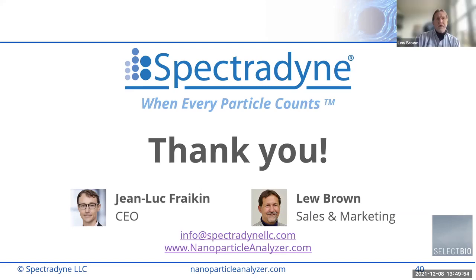Just wanted to add one quick comment on what you just said, Jean-Luc. When we do multiple measurements with multiple size cartridges, the software can automatically seam those three together into a single distribution. So that's not something you have to worry about. Yep, thanks. Good point. Thank you.